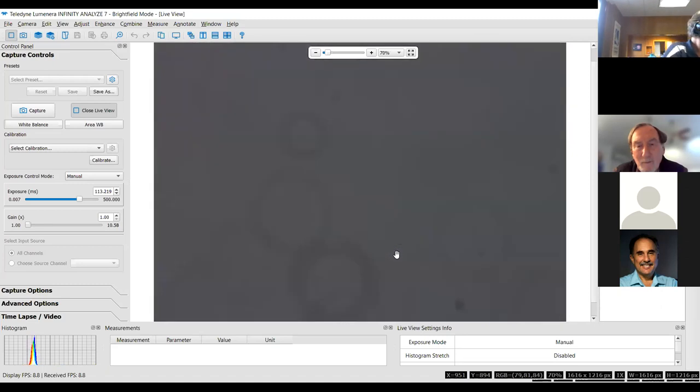And then there also are single Fragilaria that are relatively teeny tiny. They took a whole lot of what used to be in Synedra and put it all in Fragilaria, with just a couple of exclusions. So this is one of those small single Fragilarias that has maintained the name Fragilaria. Probably tenera is my best guess. And that's a case where they've sort of lumped something that we used to look at as separate. So it's one of the few times you don't have more things to worry about.